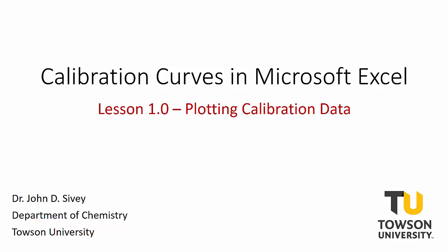The purpose of this video is to demonstrate how we can use Microsoft Excel to plot and properly format calibration data. Throughout this entire series of calibration curve tutorial videos, I will be using the 2016 version of Microsoft Excel for PC. If you are using a different version of Excel, particularly if you are using a Mac, there will be some differences in terms of syntax and keystrokes as you proceed through these tutorials. Nevertheless, it is very important for you to become familiar with these calculations using your version of Microsoft Excel.